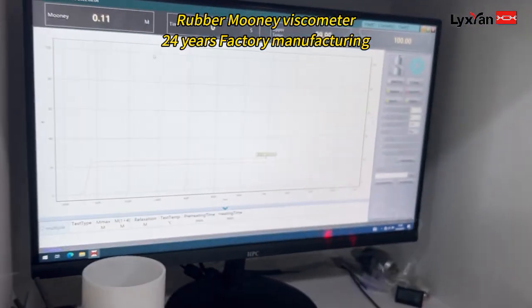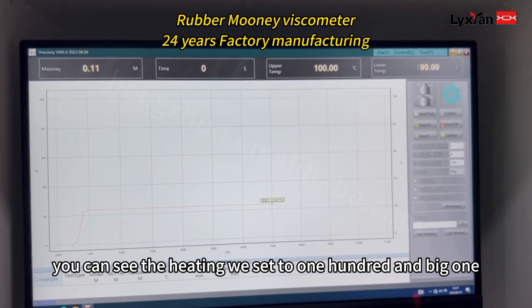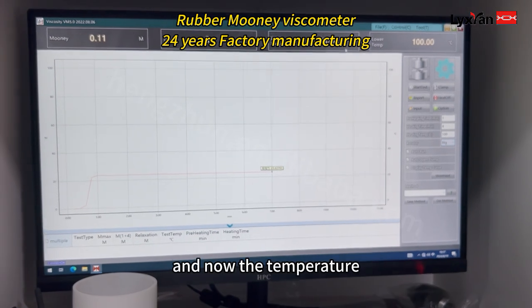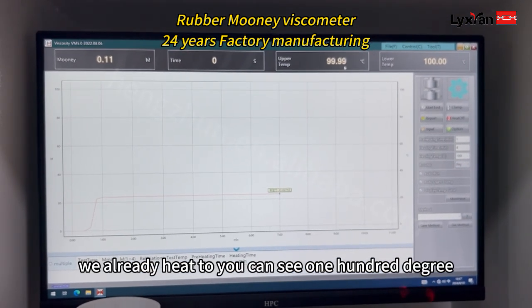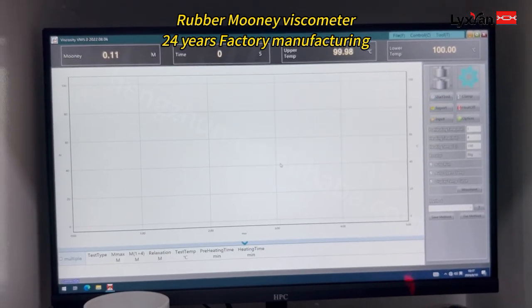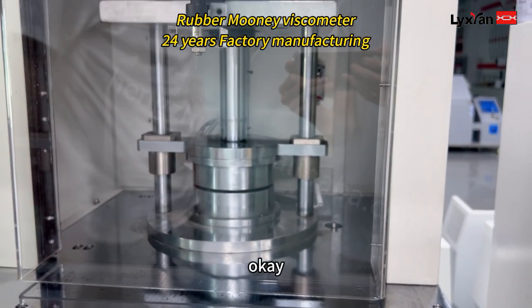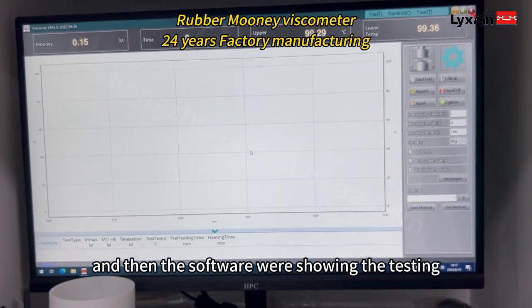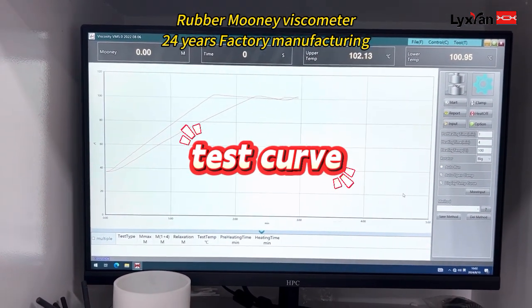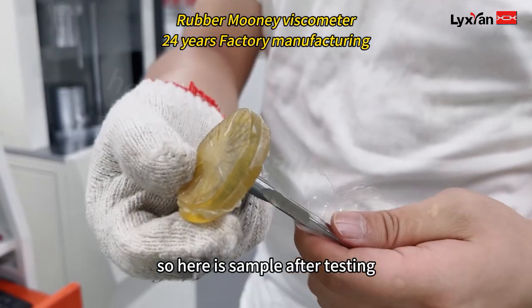Here is the software we opened. You can see the heating — we set it to 100 degrees. The big rotor is used for the Mooney, because the heat cavity is smaller. The temperature has already heated to 100 degrees, both upper and lower, so we can start testing directly. We close the mold, and you can see the software is now showing the testing. Here is the sample after testing.